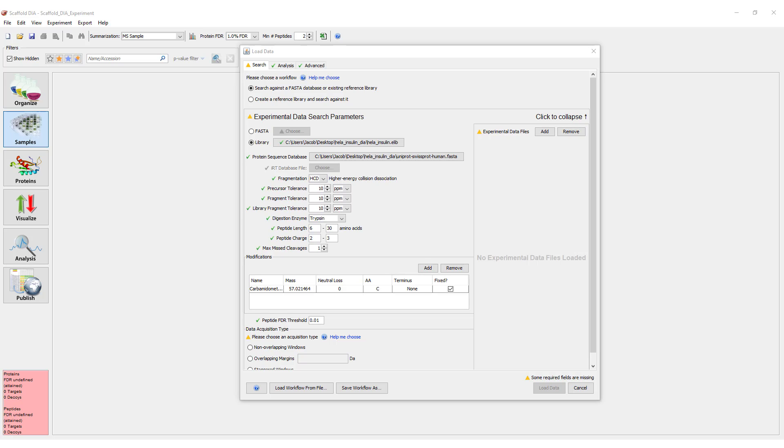In this example, we are searching an ELib file, which means the option to add an IRTDB is disabled.